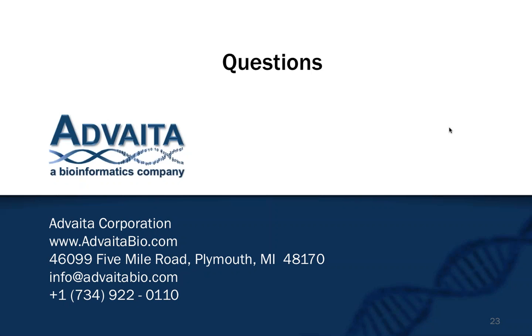We have quite a few questions here, and one of the first questions we had is from a user who was uploading data where he had pre-filtered the data. Can you elaborate on uploading the entire list of genes and how you can specify the thresholds within the application?